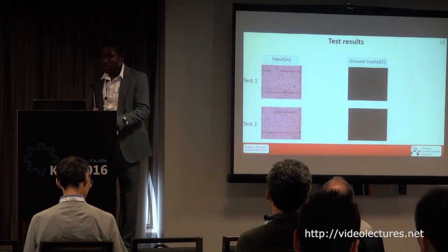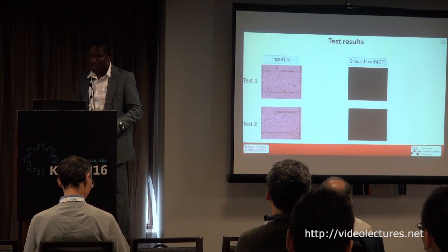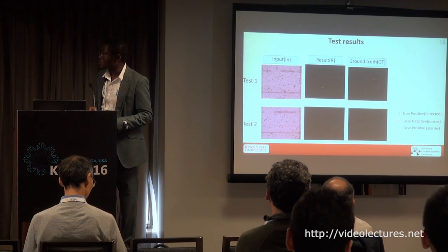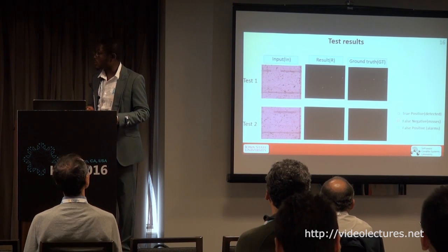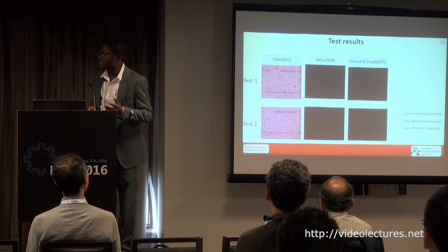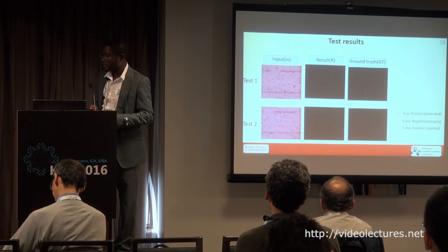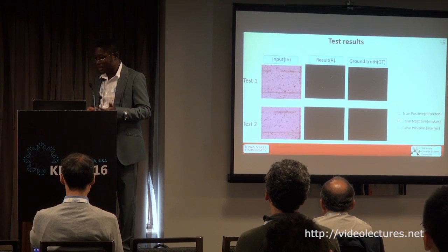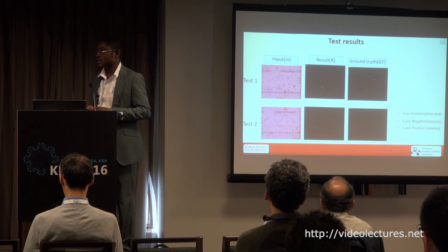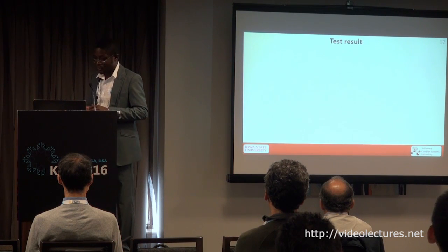So I also show some results for two extreme cases. In the first case, the algorithm is able to detect all the eggs and discard the debris. And then in the second case, we have some similarities between the debris and the eggs, basically. And so the algorithm makes some misses and some false alarms, basically. But that's in a few frames. And I'll show further results here.